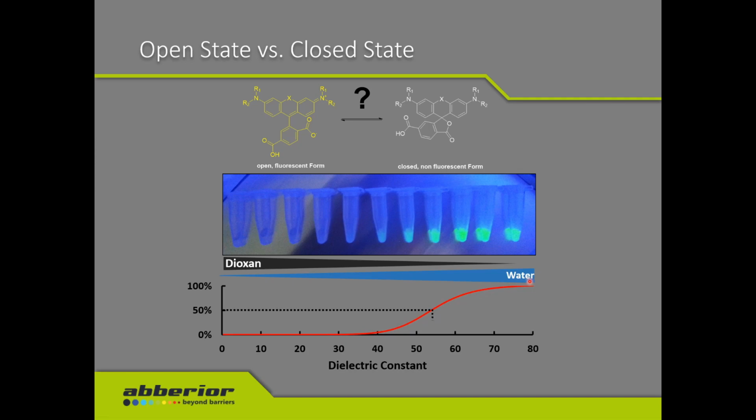Now at the point where we have reached half of our possible maximum absorption intensity, this is a value we call D50, and this D50 value gives us an idea whether our fluorophore can exist also in this closed form and being therefore highly cell permeable.